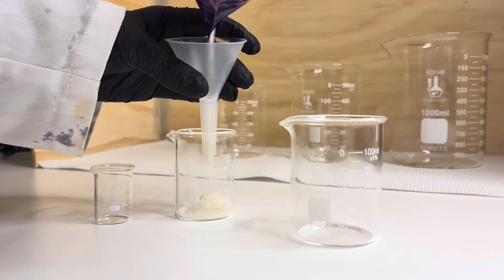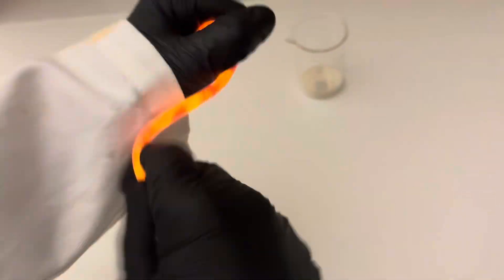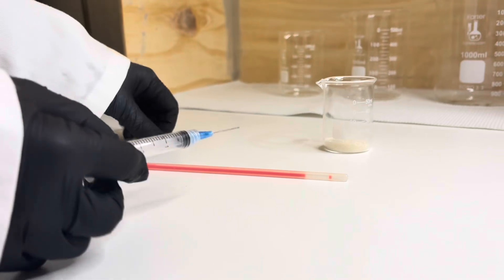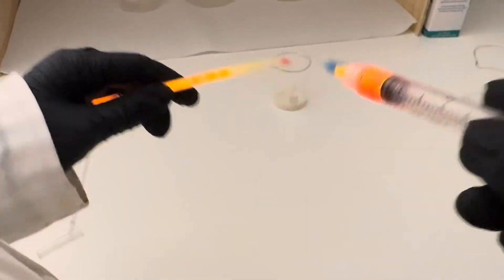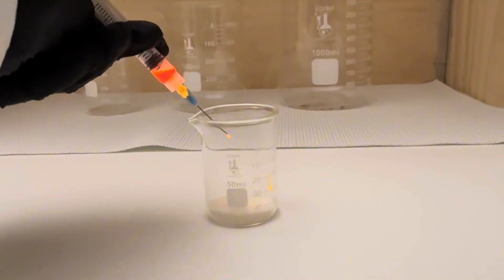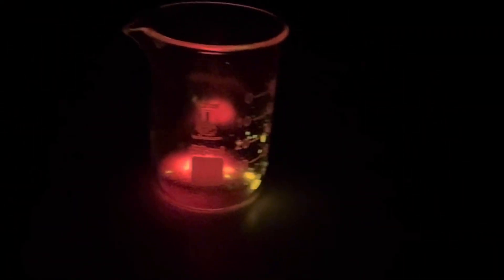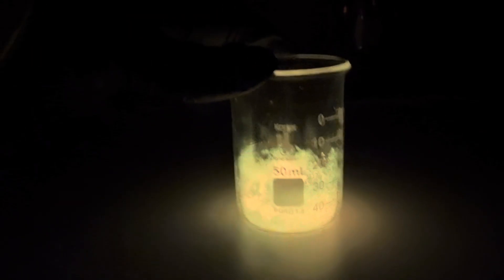For the next experiment, I wanted to see if I could make the carbon snake glow using glow stick fluid. Glow stick fluid contains chemiluminescent chemicals. I'll extract some using a syringe and add it to the sugar. You'll notice the color changes as I mix it — this is because the sugar's chemical environment alters the dye's energy states, shifting the wavelength of light it emits.